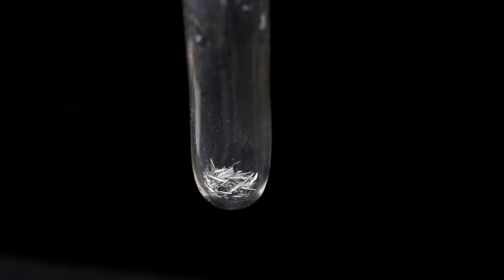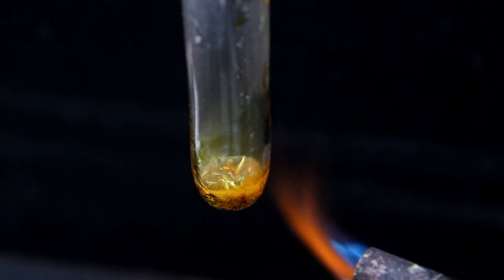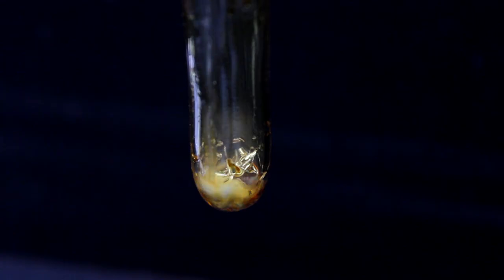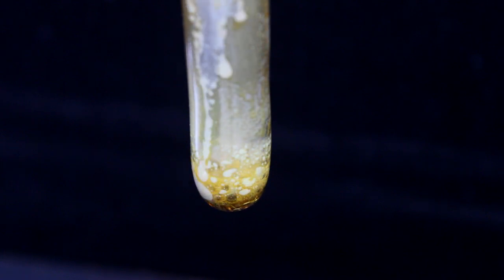So let's try something much more reactive — our old friend magnesium. Nothing? Really? I thought this stuff was at least supposed to be corrosive. It won't even react under the heat of my blowtorch. It only reacts when I add a drop of water, but I'd say that's just because sulfur chlorides turn into hydrogen chloride when mixed with water.